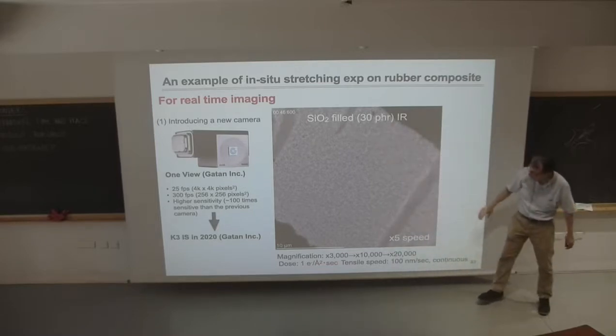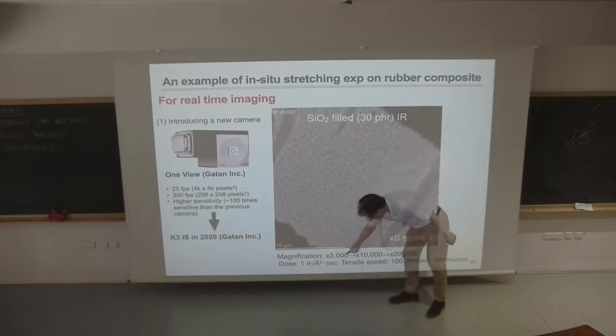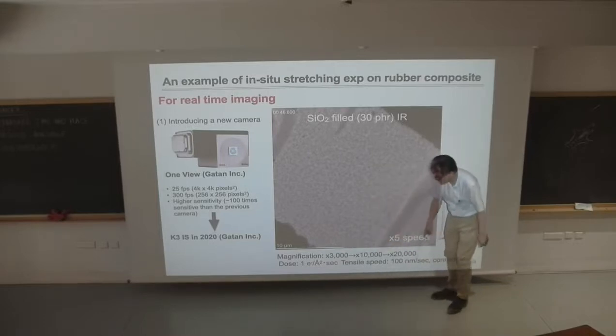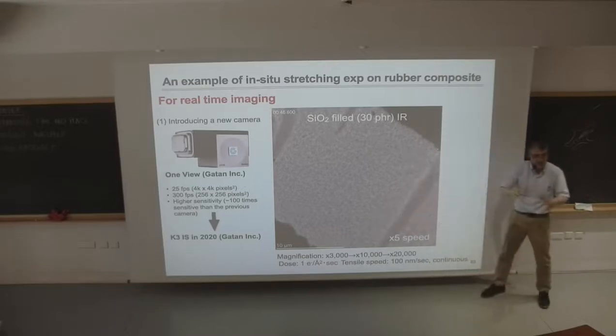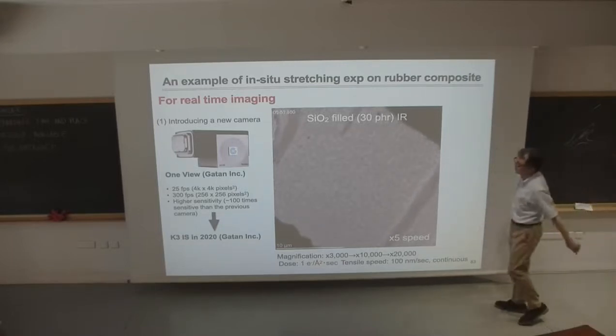Okay, so I will stretch this sample this way first for this magnification, and then the movie changes the magnifications. From 3,000 to 10,000 and 20,000, it's going to be magnified and magnified. Okay, so we start to stretch.